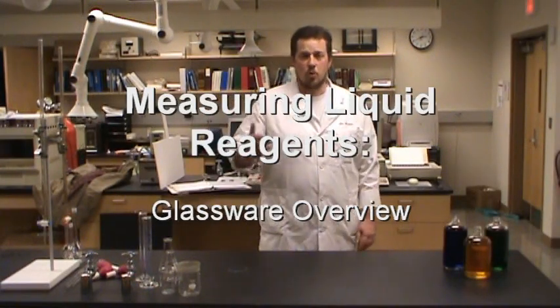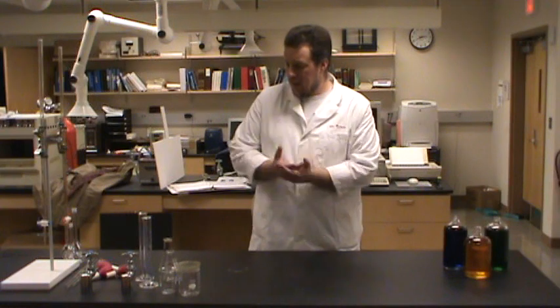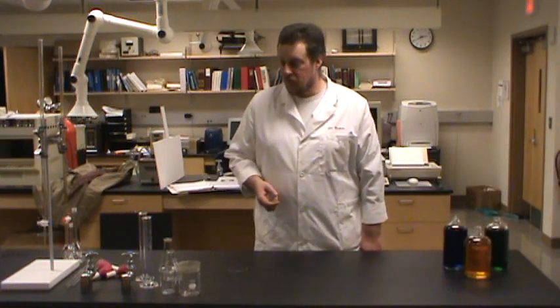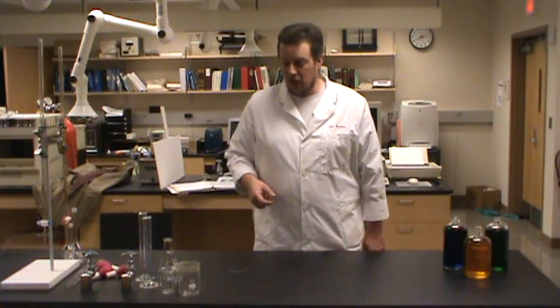In almost all of the experiments that we do in general chemistry, at some point we're going to be using some liquid reagent, whether it's an acid, a base solution, or even just some water. We want to take a look at some of the glassware we've got available to help us handle that liquid. Let's take a little walk through and look at some of the glassware that we're going to use in the lab.